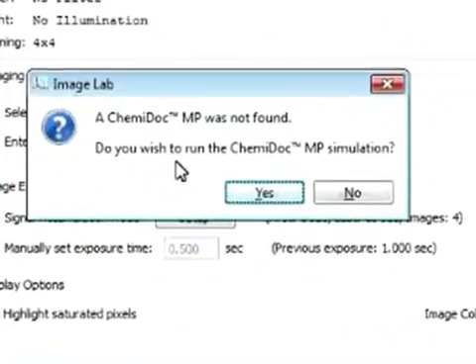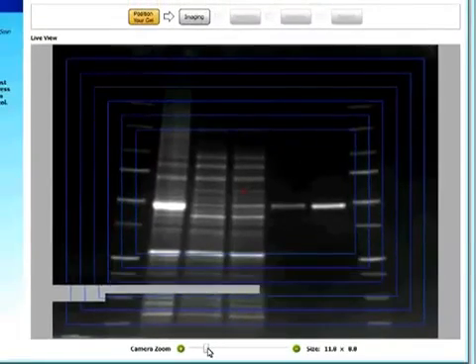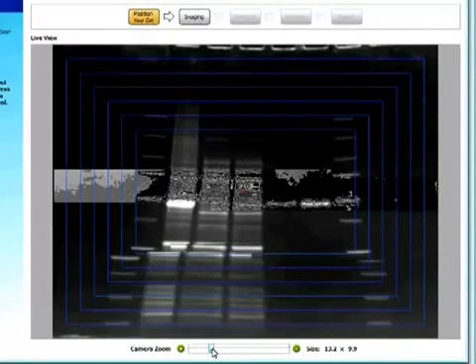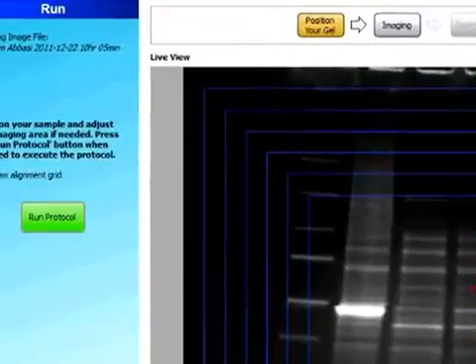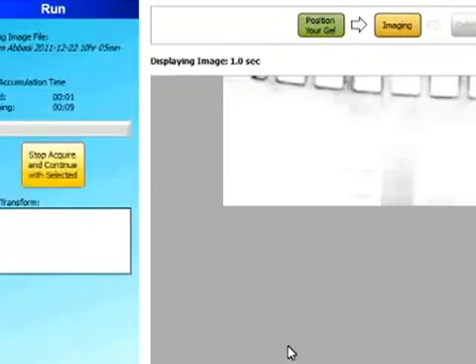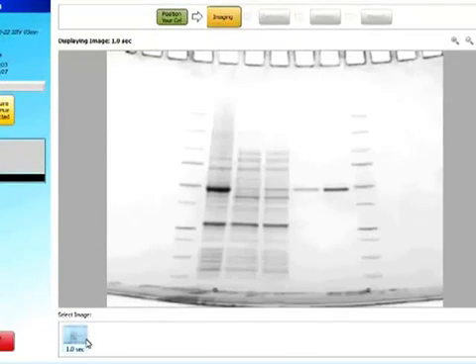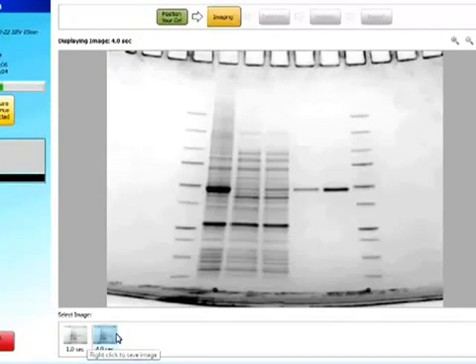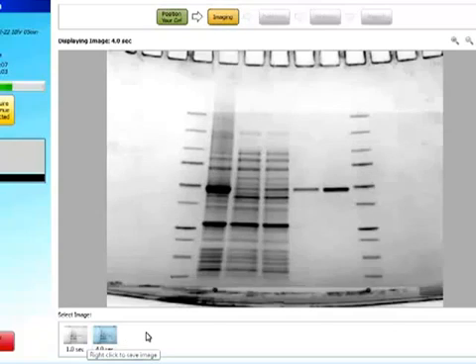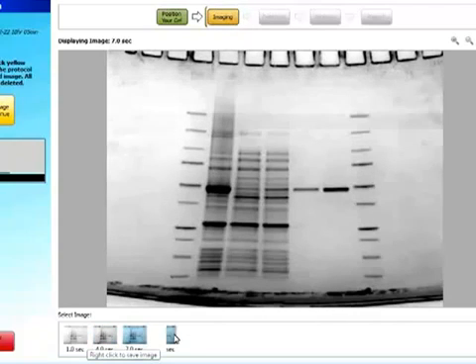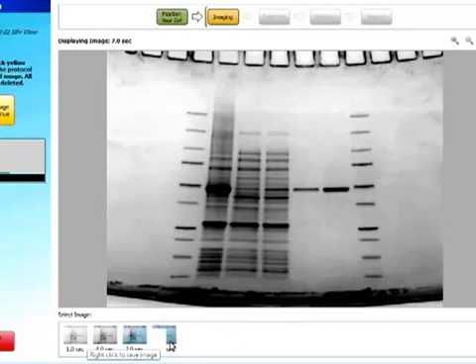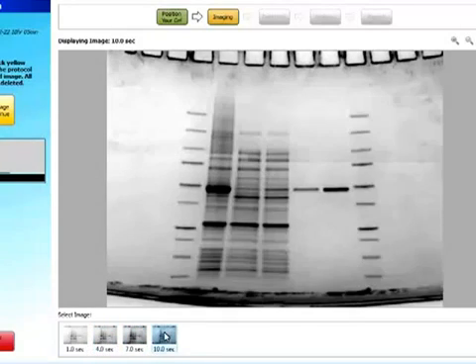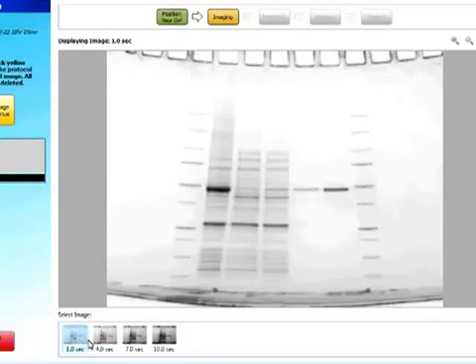And then when we position gel, we can also select to zoom in or out. And then run the protocol. So first second. And then the image at 4 seconds. And 7 and 10 seconds. So there. Now I can look at each of my images.